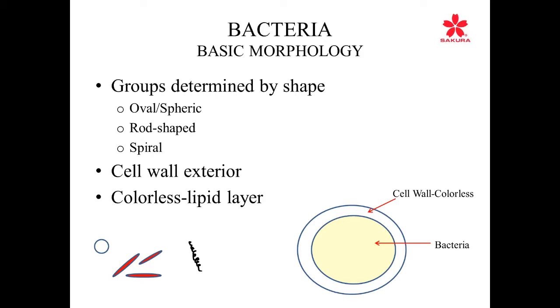There are basically four different types of staining techniques when you talk about bacteria. There's differential staining, where you do a stain, then decolorize it and do another stain over that. Then there are acid-fast stains, where this lipid layer makes the organism resistant to acid decolorization. The third category is silver stains.